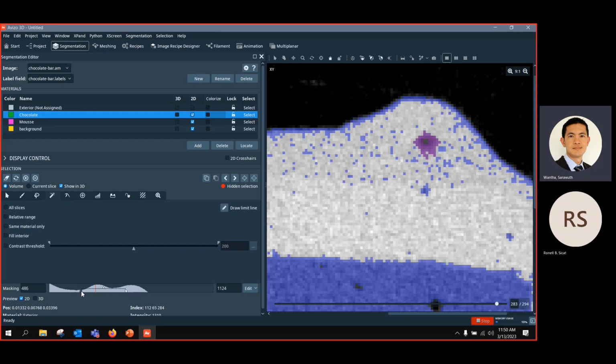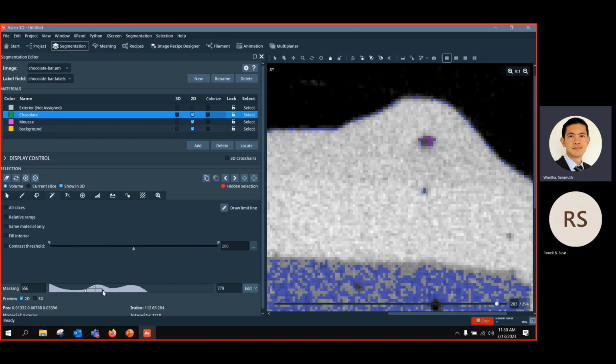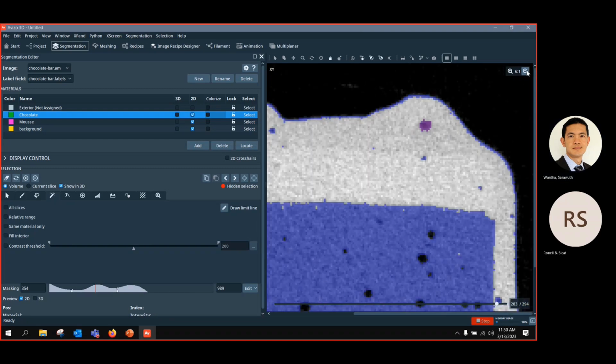But if I start to remove the lower threshold, and also with the higher threshold, it will limit the number of voxels selected based on this region growing value. I hope you see the example. Not everything is selected, even if connected, because the intensity is outside this threshold value. But this can be clearer with a different example, which I will show you later.